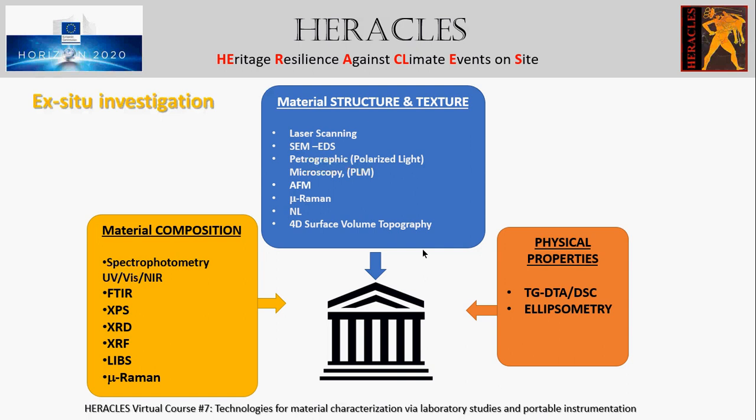Nonlinear microscopy uses tightly focused femtosecond laser pulses to perform high-resolution microscopic measurements. Nonlinear imaging is a type of laser scanning microscopy. Its potential for depth-resolved imaging to study a number of materials of interest in cultural heritage has already been demonstrated.